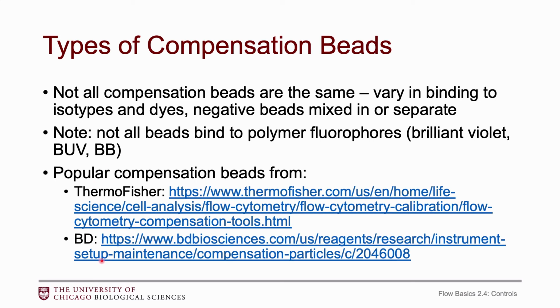And here are the links to the Thermo Fisher and BD beads, which are probably the most popular. I actually did hear that Thermo Fisher came out with some new beads that are a little bit better with these polymer fluorophores, so keep an eye out for those. But it's really up to you if you want to use compensation beads or not. Some people find them to be easier, some people find them to be more difficult.